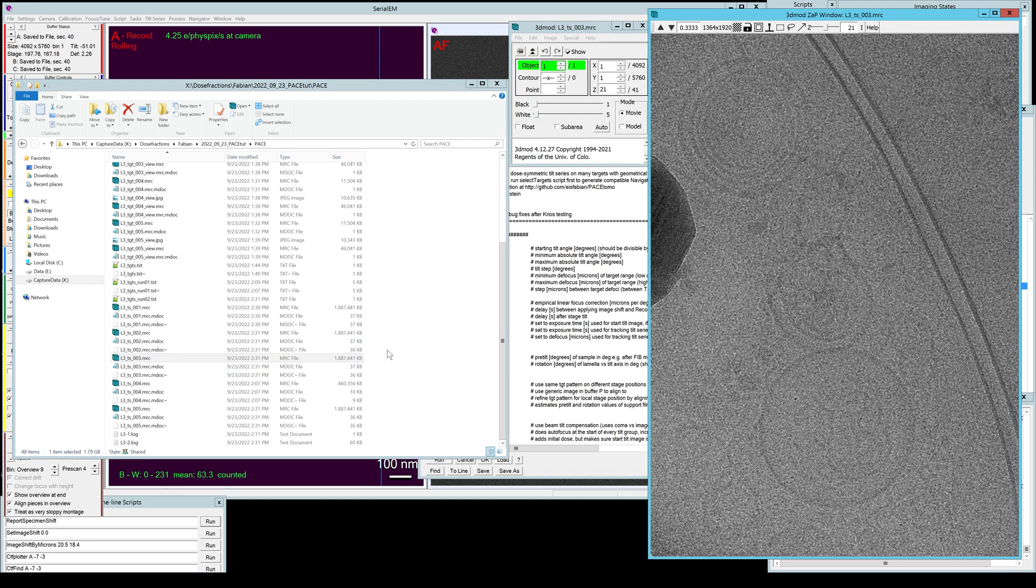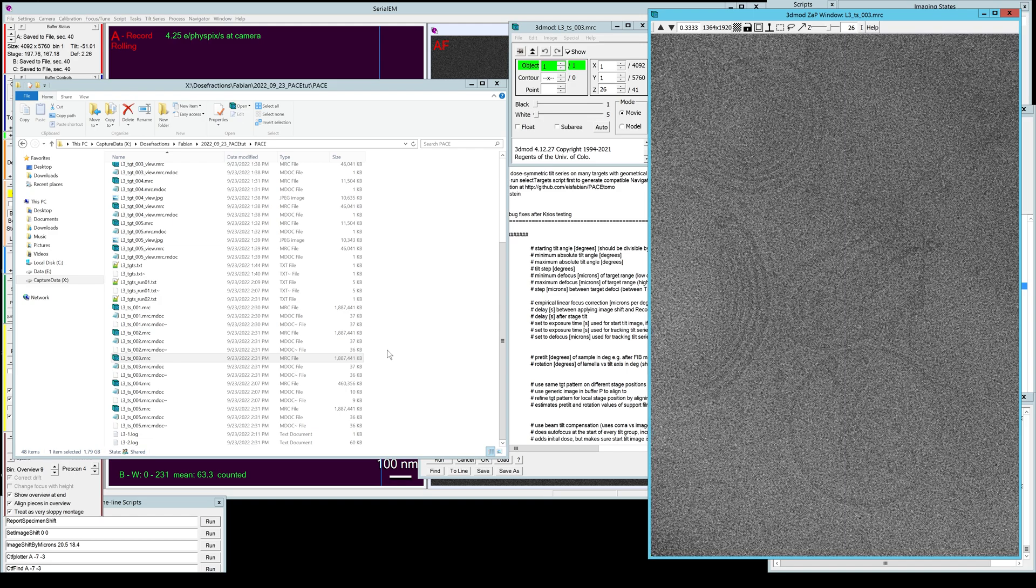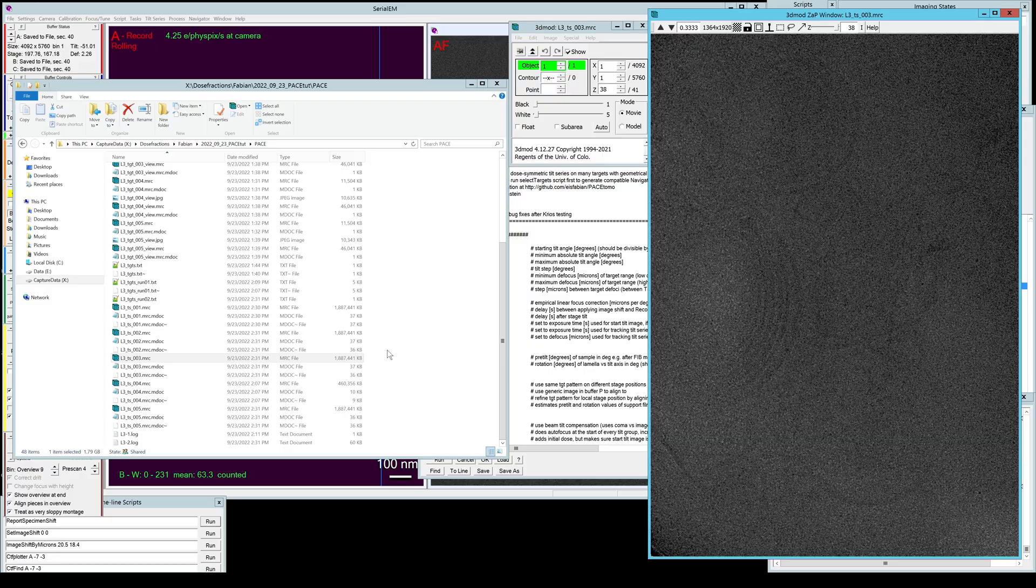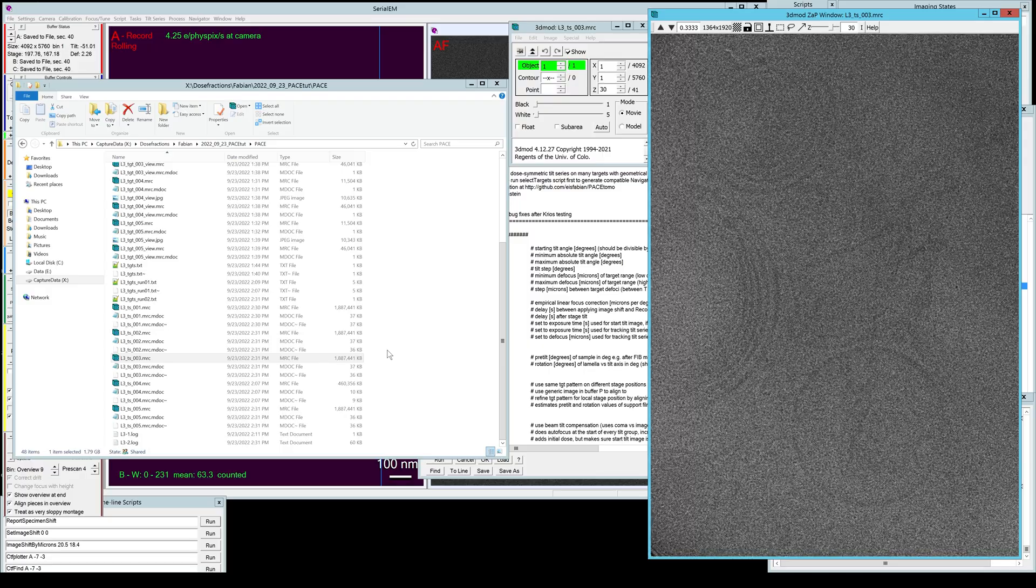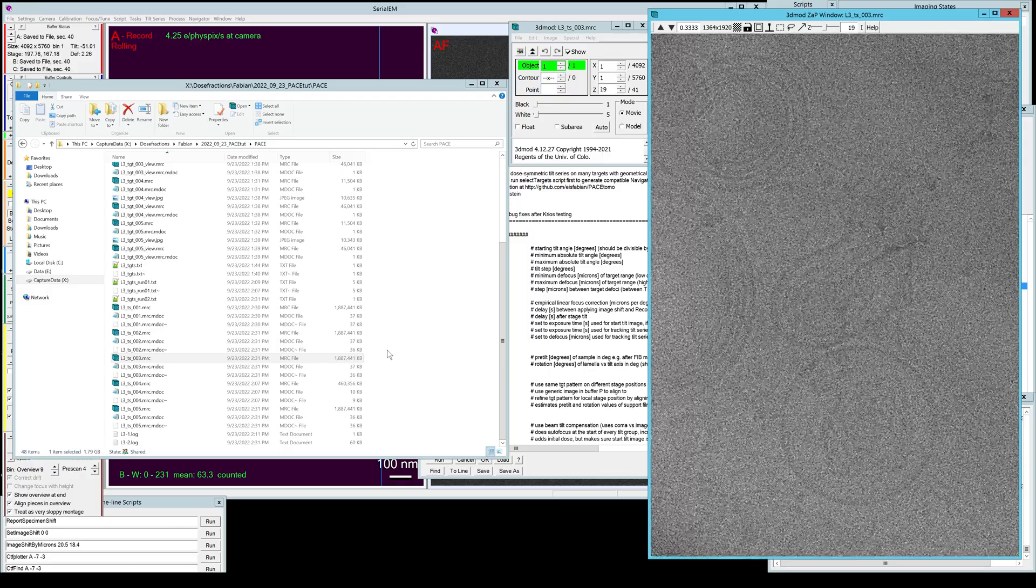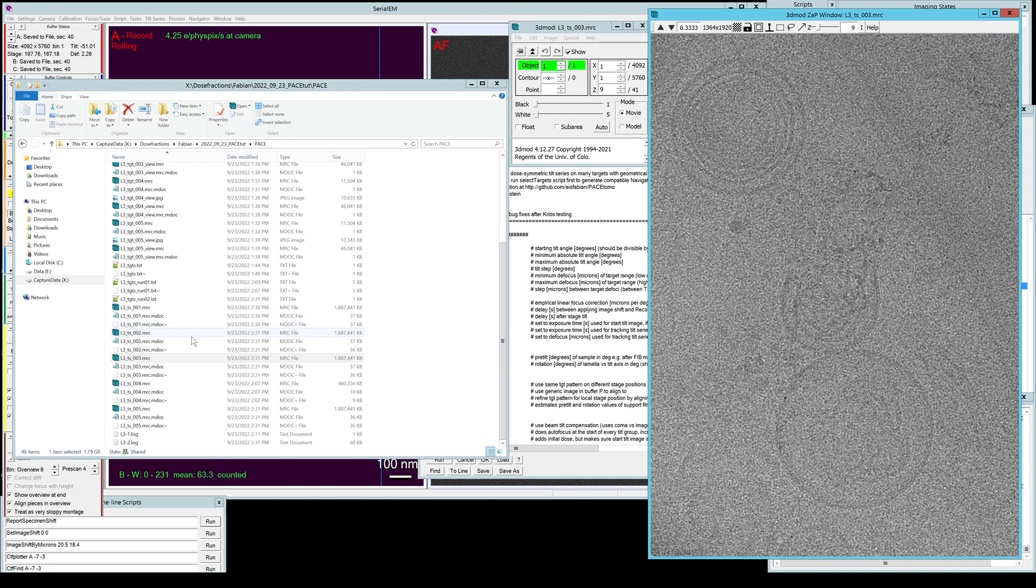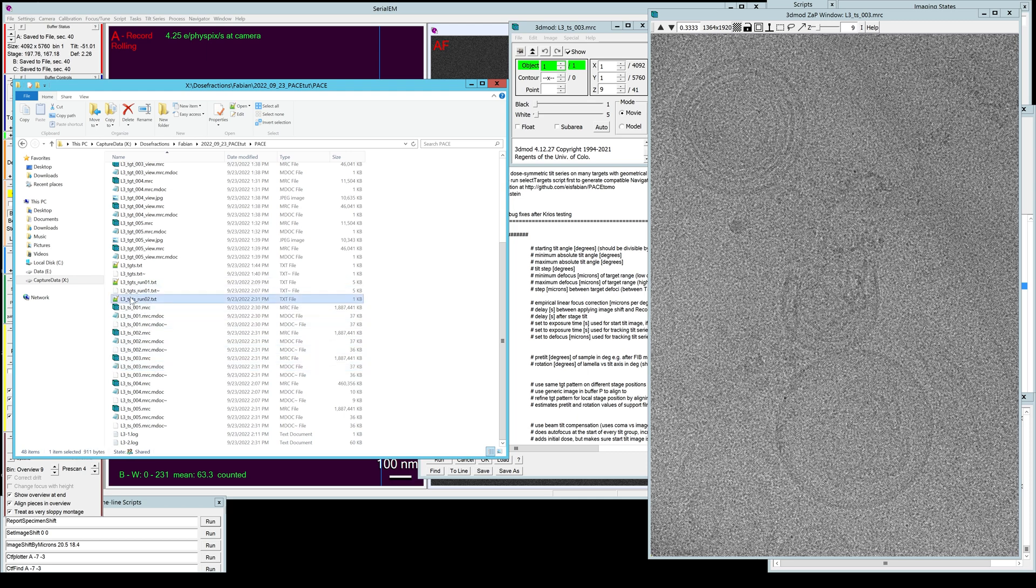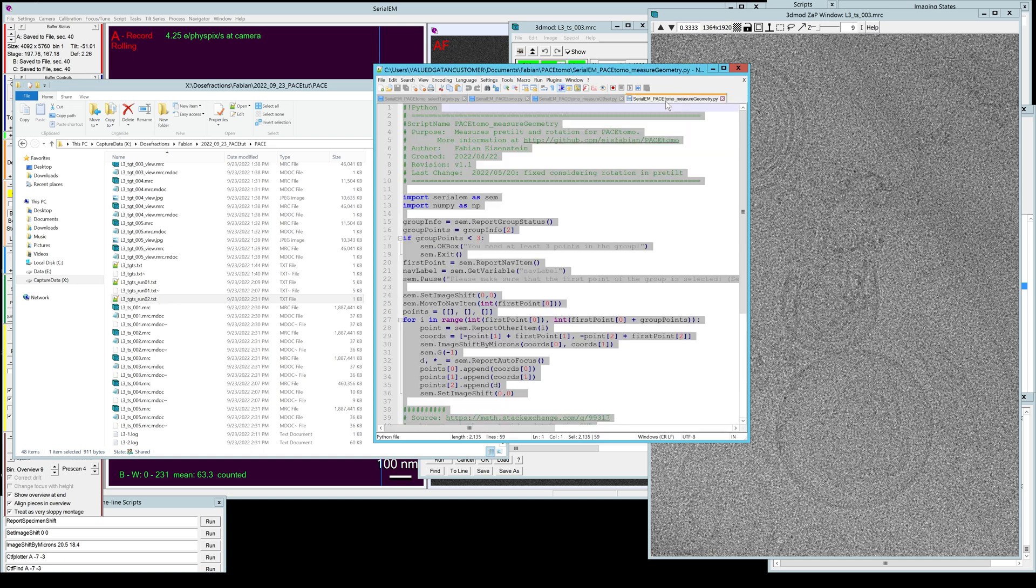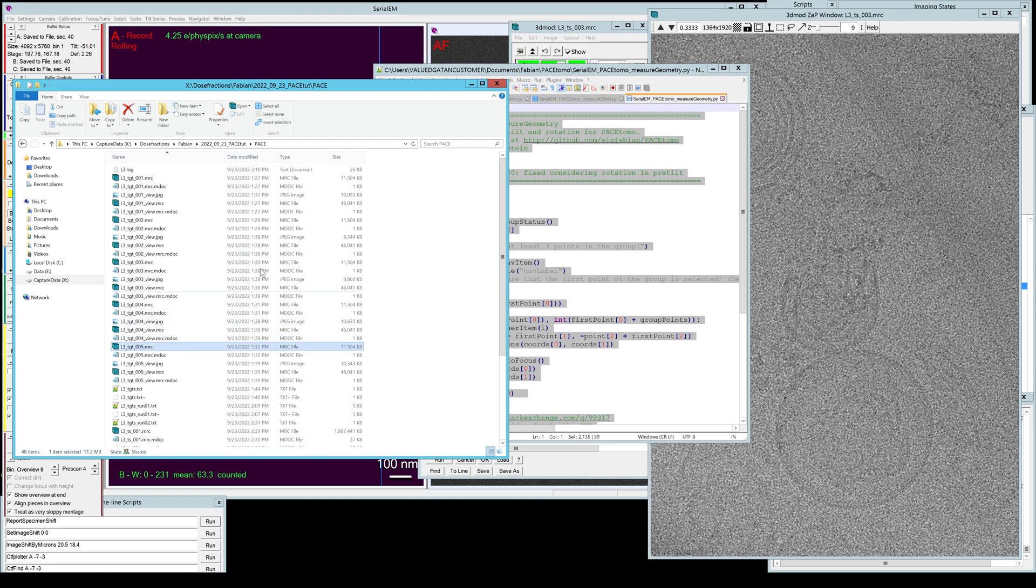What is noteworthy is that these tilt series files are not yet sorted by angle. So this has to be done either by using IMOD's alignframes or via your own custom scripts. But your tilt series files are here, the necessary mdoc files are here, you have the log files, and you also have the output of the target run file, which again gives you the names and the image shifts and everything else like that. So yeah, this should be all you need for reconstruction.